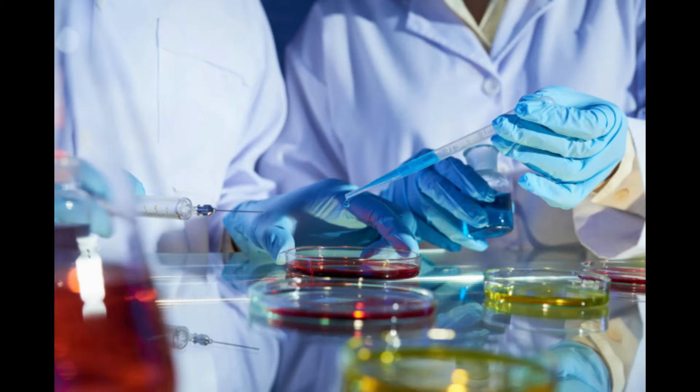And so it's very easy to tell if it's the only one on your plate when you look at it, because if you have white colonies or purple colonies or whatever it may be, anything other than the red colonies that is Serratia, you know that you introduced something else onto your sample. Because it produces a red pigment inside the colonies, it has a lot of history behind it, Serratia does.